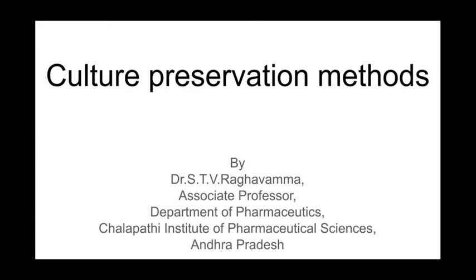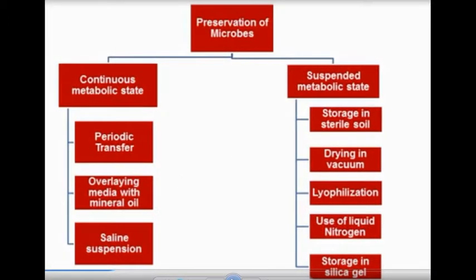Very good morning. I'm Dr. Raghavamma, presenting on culture preservation methods. These methods are widely used for preserving the microbial cultures for different purposes.